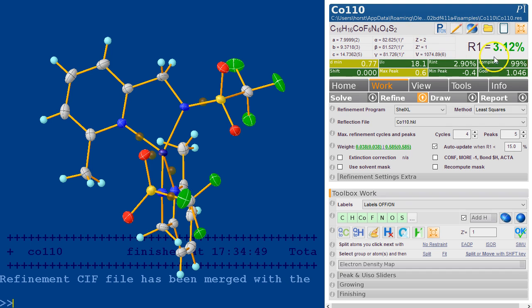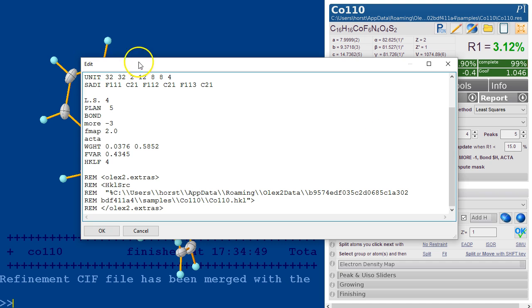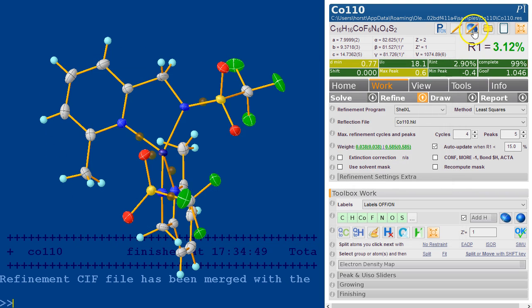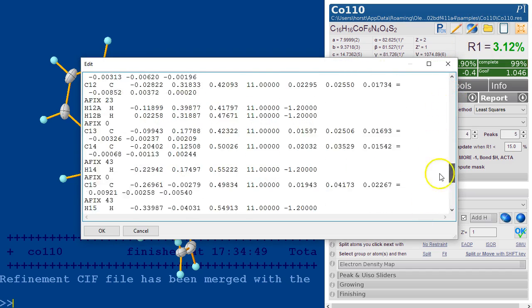Here I just briefly introduced the concept of the file. You can actually get to the files. This button here shows you the instruction part of the file. This is everything before the atom list.